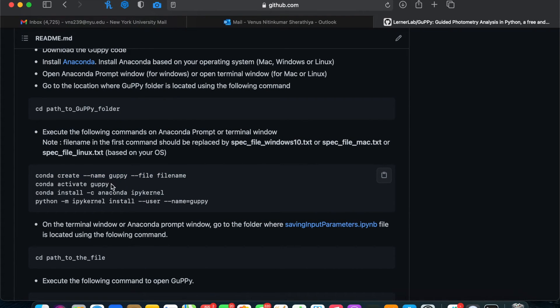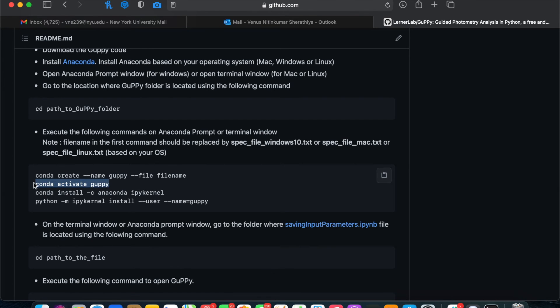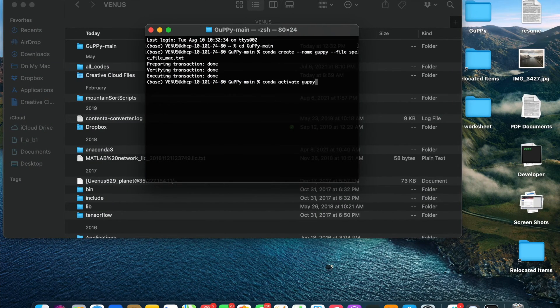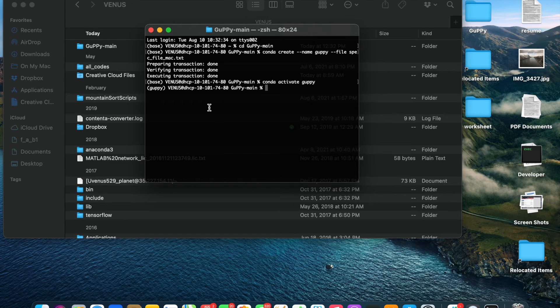Once that's done, follow the next steps to install the appropriate packages for this environment.